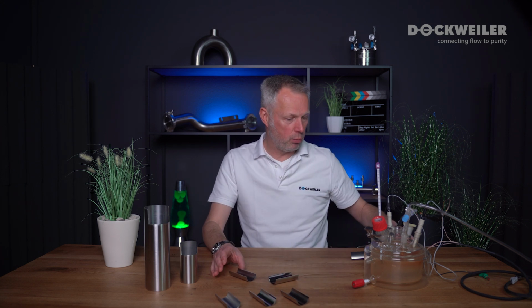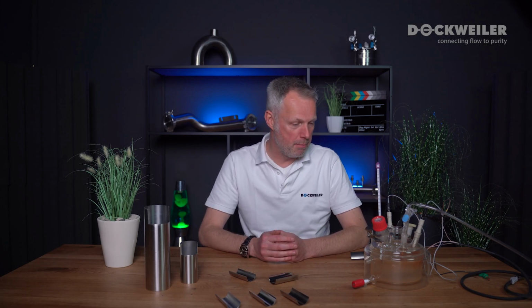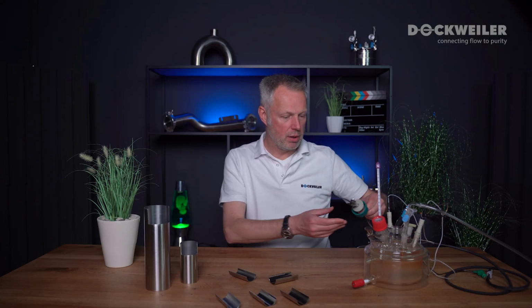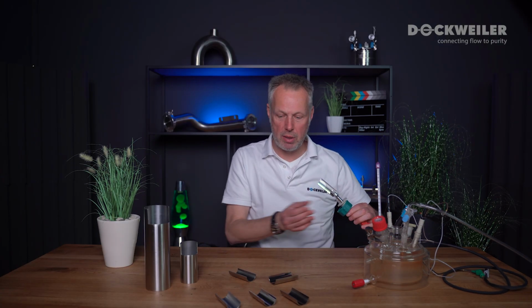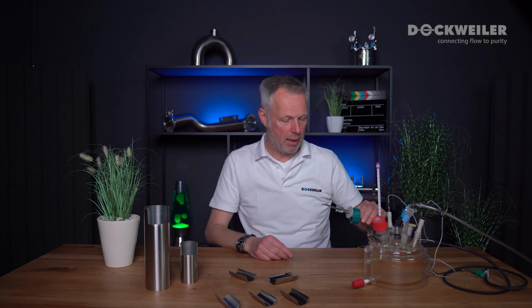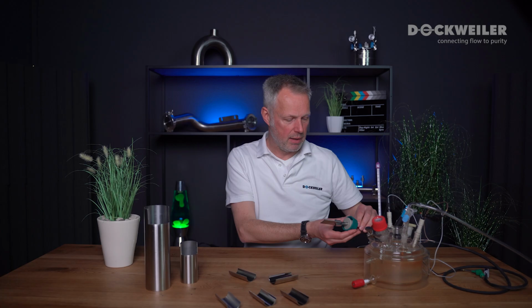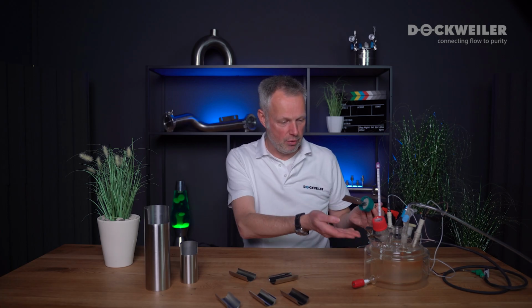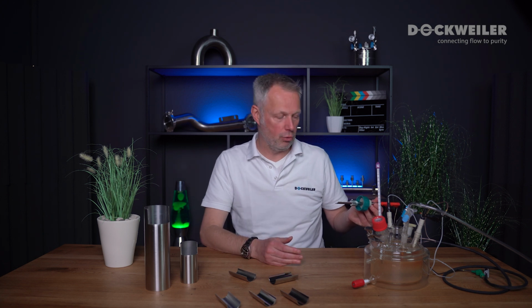And what I brought with me here in this system is what we call a CPP testing method system. In this unit, we are preparing specimens of the different parts we would like to test, and we're going to introduce that into that system as a kind of working electrode.